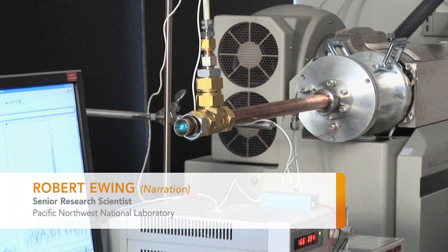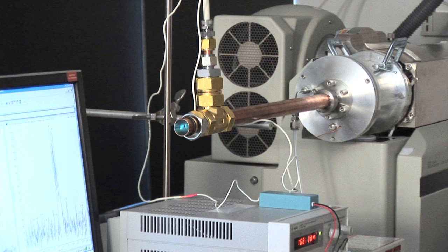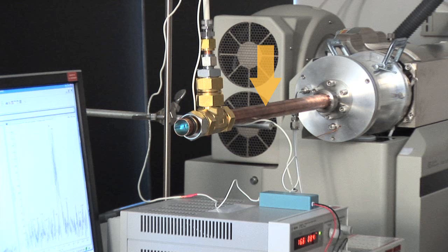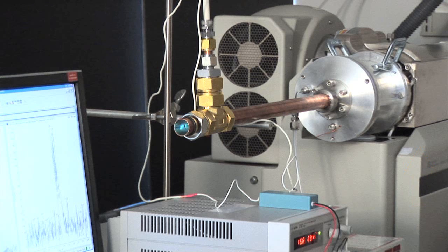This is a demonstration of the real-time vapor detection capability developed here at PNNL. This is an ionization source built at PNNL for the selective ionization of explosive compounds. This is a reaction tube which provides a longer residence time and enables enhanced vapor detection of explosives. This is a commercial mass spectrometer, and the interface of the ionization source with the reaction tube to the mass spectrometer will enable the rapid commercialization of this technology.